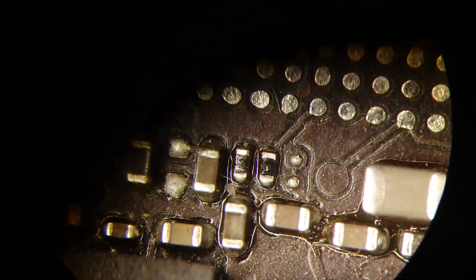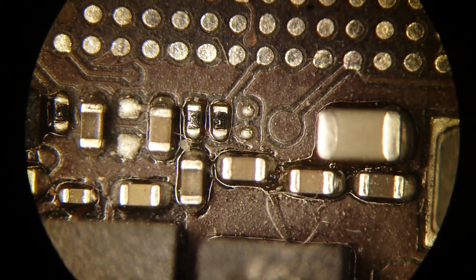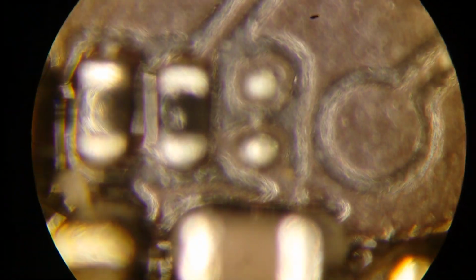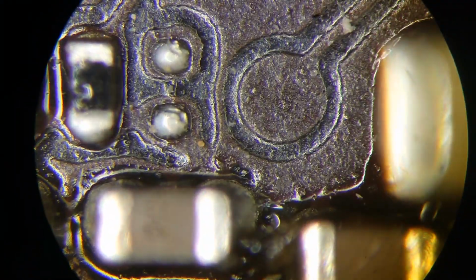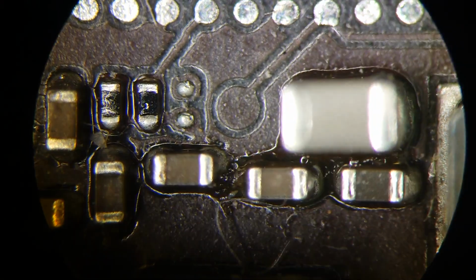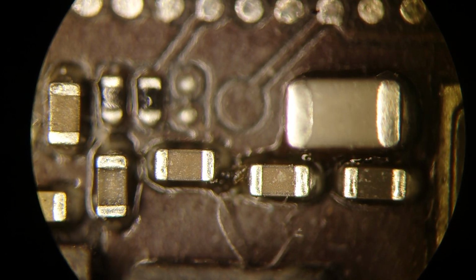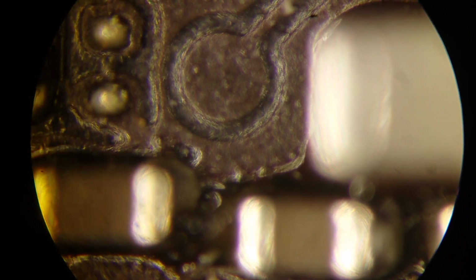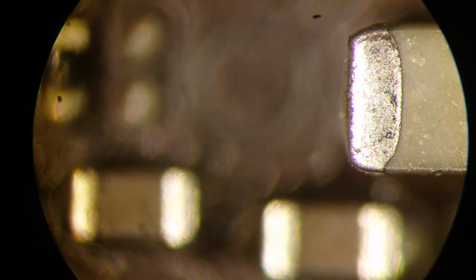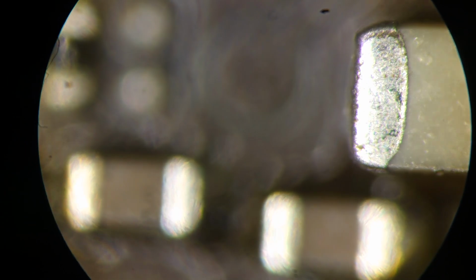Because I have changed the objective, I need to refocus the whole microscope to get a stable focus over the whole range. So in our case, I need to find proper focus here, and we can see it's a place I already looked at with other objectives, but this objective has a very narrow depth of field. So when we turn it to maximum magnification, you can easily see that when we focus on the top of this pretty huge part, all others are just fuzzy.